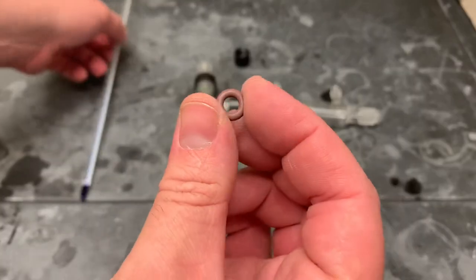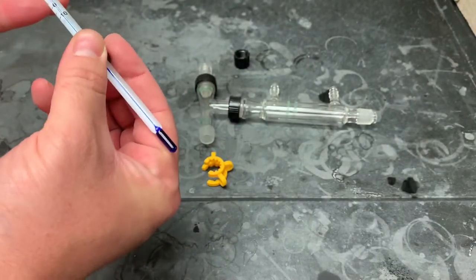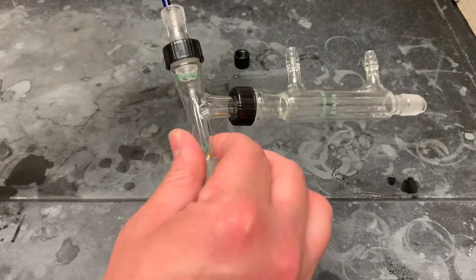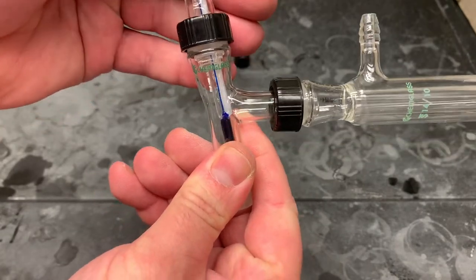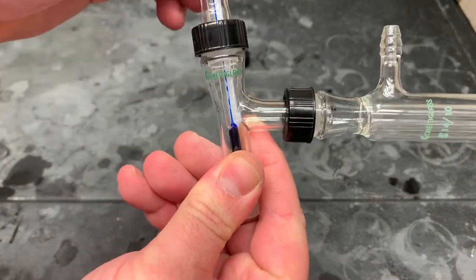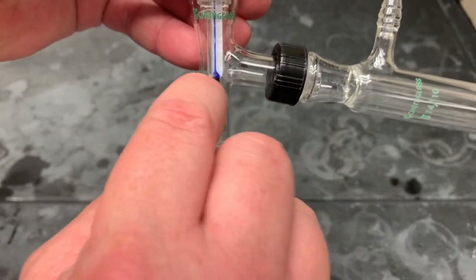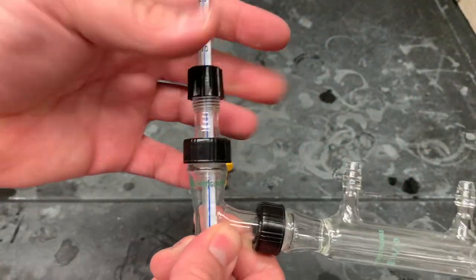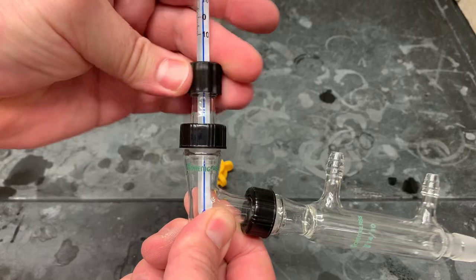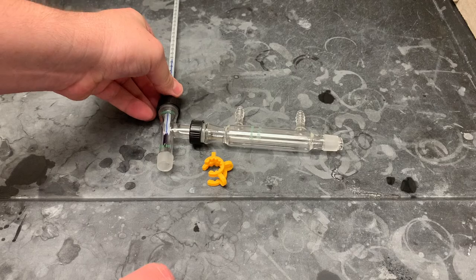And we're going to take our little O-ring and slip it here. We're going to guess how deep we need to go. I'm going to guess only about this deep. Let's see how that lines up. That's actually not quite deep enough, so I'll push that down a bit, and that looks about good. You can see that the bottom of this glass lines up with the top of that. That's about where we want to be. Then take our last one here and just slip that on. Tighten this nice and tight. And then put this aside, ready to be used in a moment.